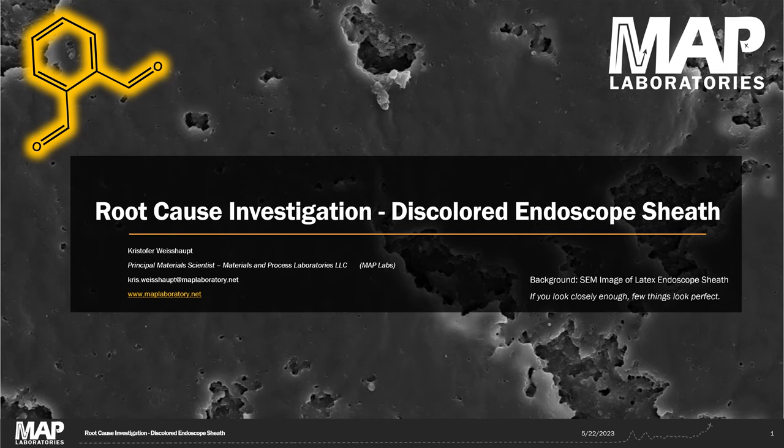Hi all, Chris Weiswakt here. Today I'm going to talk about another medical endoscope root cause investigation. This root cause analysis is a little bit more complicated than the last one and we'll see the limitations of FTIR analysis and the advantages of moving to gas chromatography for improved detection limits.